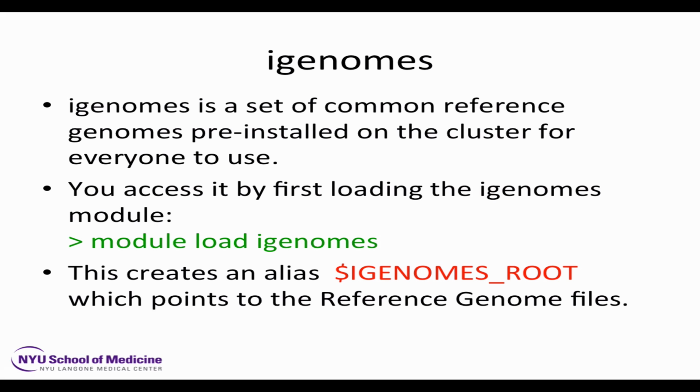And you just need to know. You need to know either by listening to this workshop about how to use TopHat, or you need to read carefully the documentation for whatever software you're using to do your mapping. It's mostly the mapping, but also the gene counting, because the gene counting requires a reference that locates each gene on the genome.